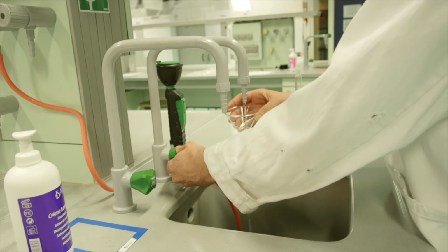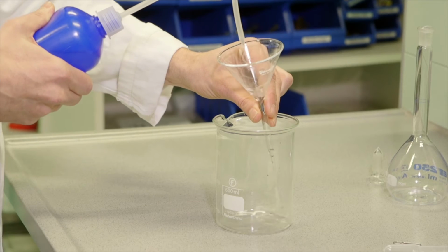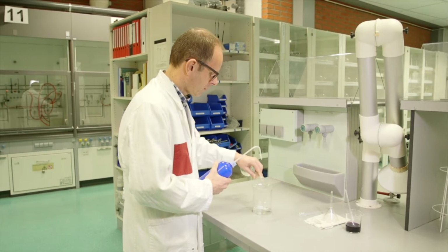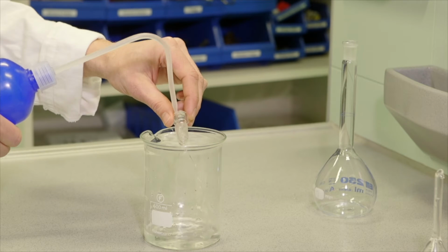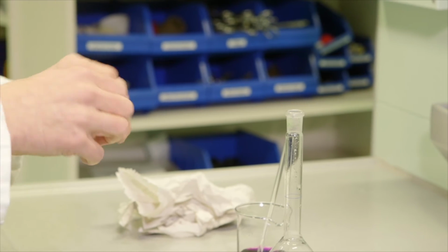Before the solute can be transferred into a graduated flask, all glassware must be flushed with tap water 3 times and 3 times with demi-water or any other possible solvent used, for example ethanol. The funnel is placed in the flask with a paper clip in between.